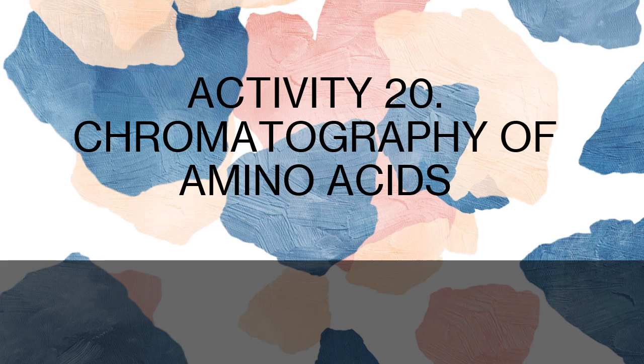Let's take a look at your Activity 20, your chromatography of amino acids. Chromatography was originally applied to separate colored substances, like in colored inks. But with a simple technique, it can also be used to separate colorless substances like amino acids, and then you can visualize the separation after you stain them.